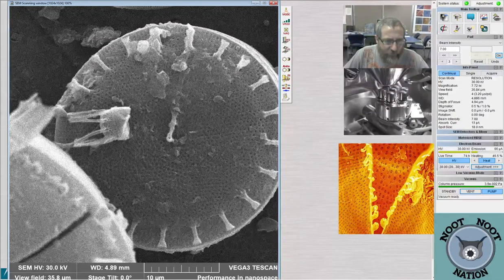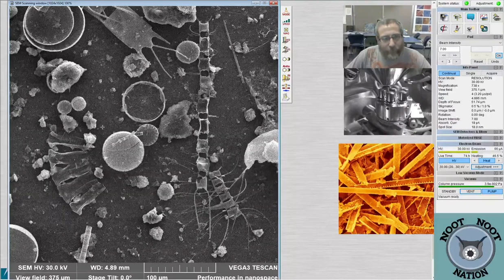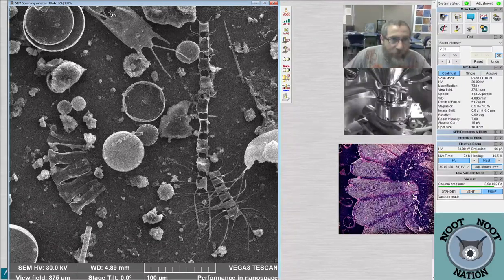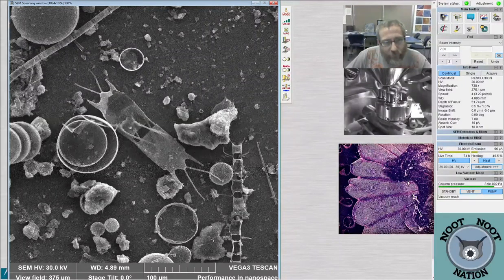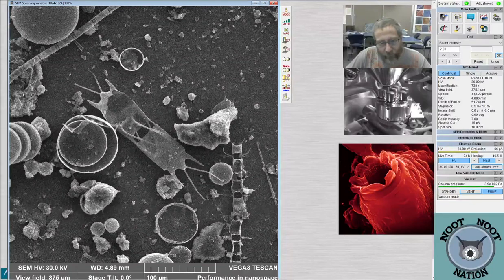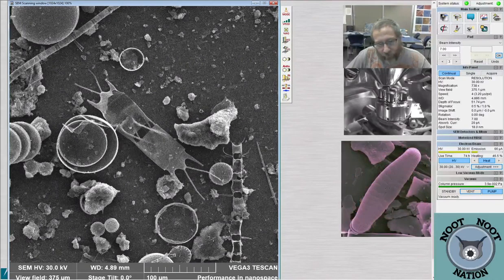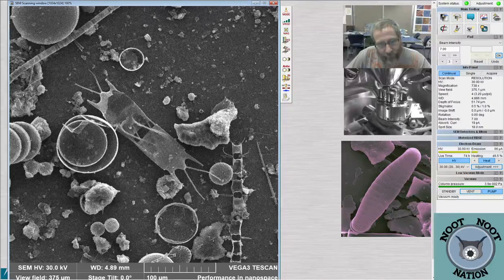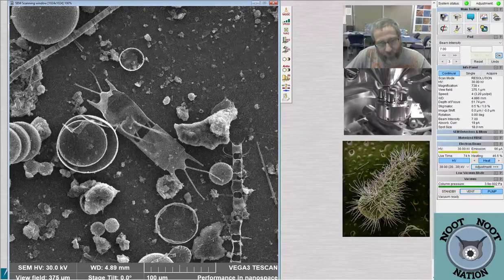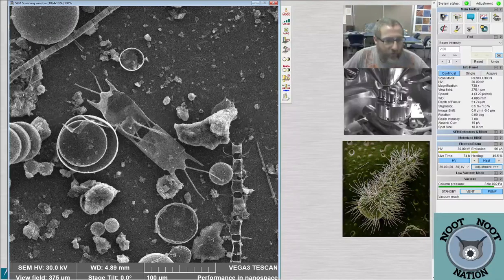Micah wants to know, what are the umbilical looking things between the diatoms? I think he means the Odontella that we just looked at, maybe? Oh, or even maybe the Thalassiosira. Possibly. So for this one, these sort of lines that you're seeing are actually the same as this, right? So there's sort of a spine that's coming out. I don't think they're actually spines, because they look hollow to me. But they're coming out of the valve face on this one. And then there's another cell right here. So they're coming out of the valve face on this one, and then there's another cell over here, so they're also coming out of the cell on this one. And then they're just sort of making a little V as they overlap with each other. And then there's two more out here.